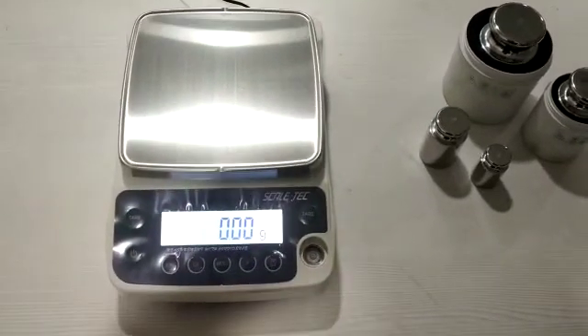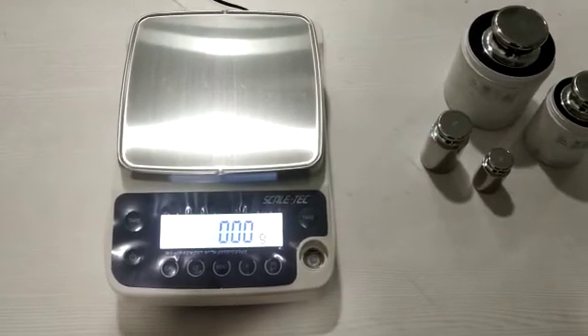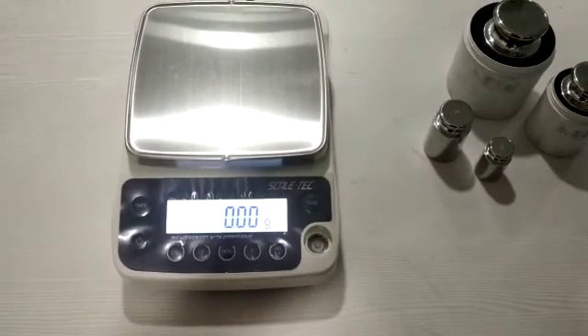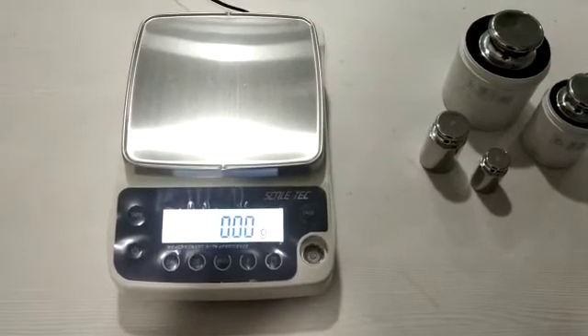Hello everyone, this is Rajesh from Scaletech Mechatronics Private Limited. Today in this video we will show the performance of the balance called 3202, which has a capacity of 3 kg 200 gram with an accuracy of 10 mg.